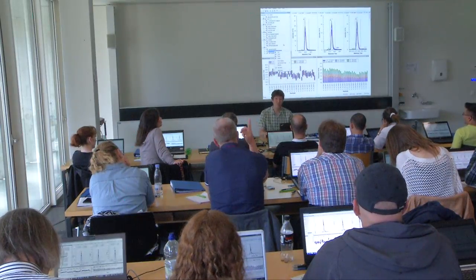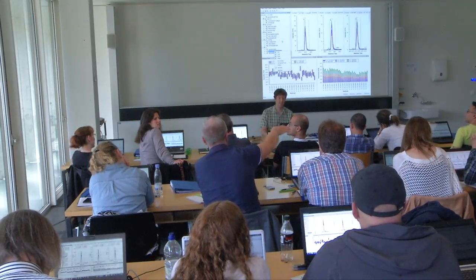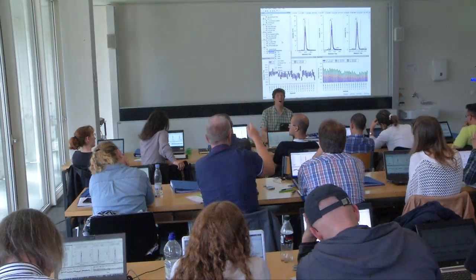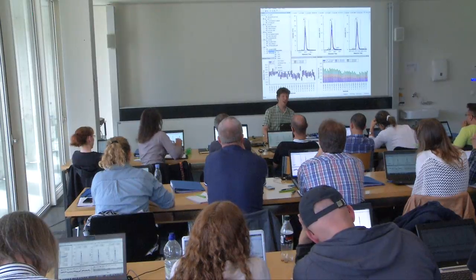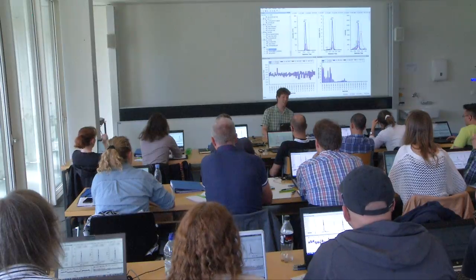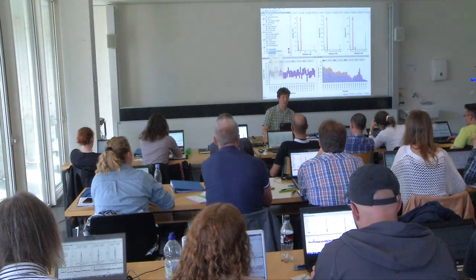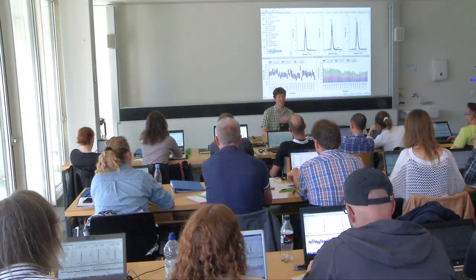But what I want to say is that on your reference peptide, when you see they decline less than the other, if you normalize to the total ion current on those peptides, that's basically what we're going to do. So right click on this peptide. The hope of the person who wrote this experiment was that we would select all three of these peptides, but after assessing the data quality, we're just going to take the one.